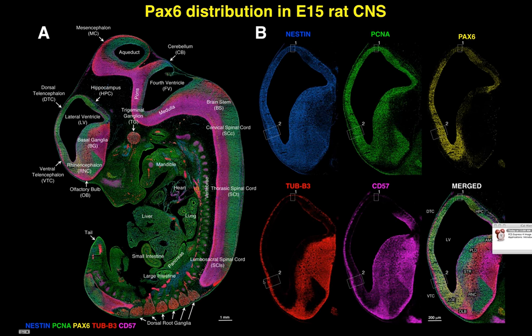And what's interesting now is that you get this gradient of neurons on one side of the telencephalic vesicle. That will be the pial surface, which is also called the differentiating zone, and the neuroglial progenitors, which would be on the CD57 label in the magenta. You can see they're all throughout, and they begin to express themselves in the ventricular surface and then move on by radial migration to the pial surface. There's also tangential migration going from the striatum as well.